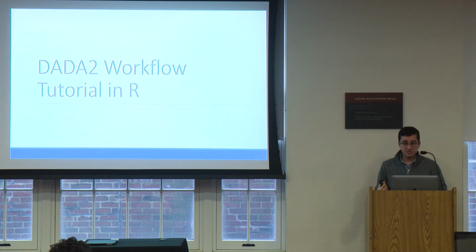So since we're a little bit short on time, normally I would suggest you run it as I'm going through it, but it might be a good idea just to go through the entire file, run all of the commands in order, and I'll talk through them so the file can be finished running by the end of this tutorial.